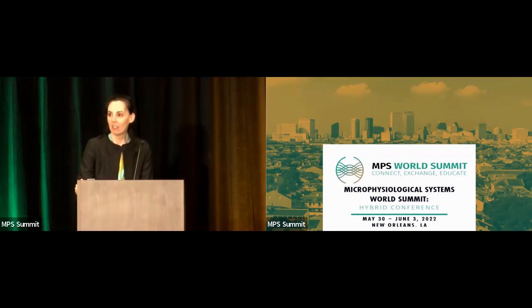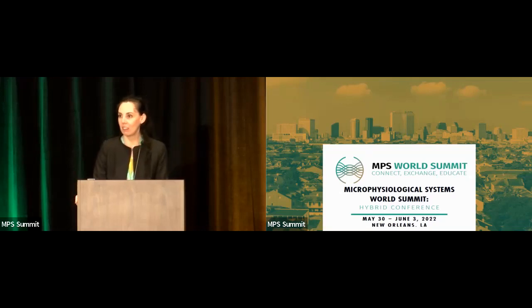Really quickly, Jorge Mojica Santiago, University of Florida. I wanted to ask you about the joint-on-chip platform that you're developing in terms of the dynamic studies that you're doing with mechanical stimulation. Have you looked at fatigue or multiple sequences and the dosing of the actual stimulation that you're applying to your cells? Yes. So what we looked at was physiological loading as well as pathological loading.